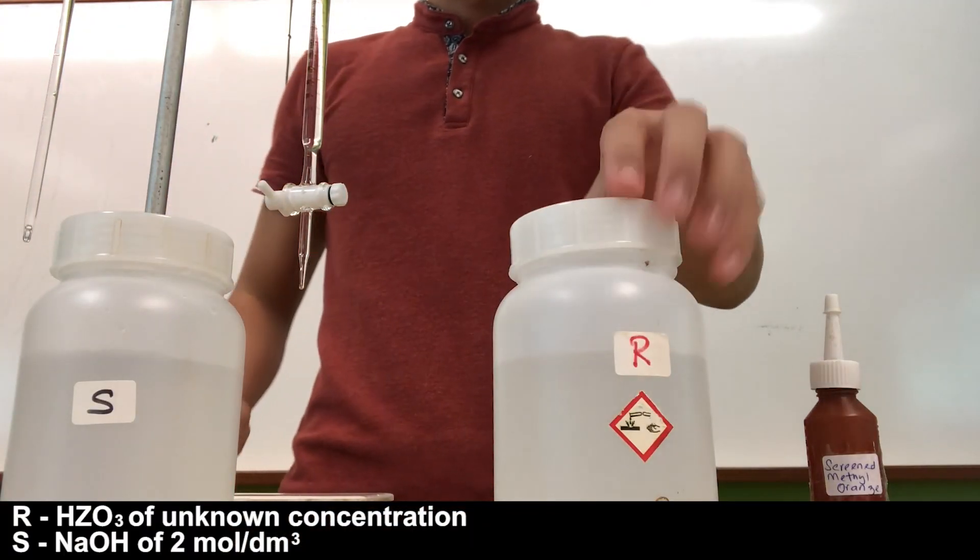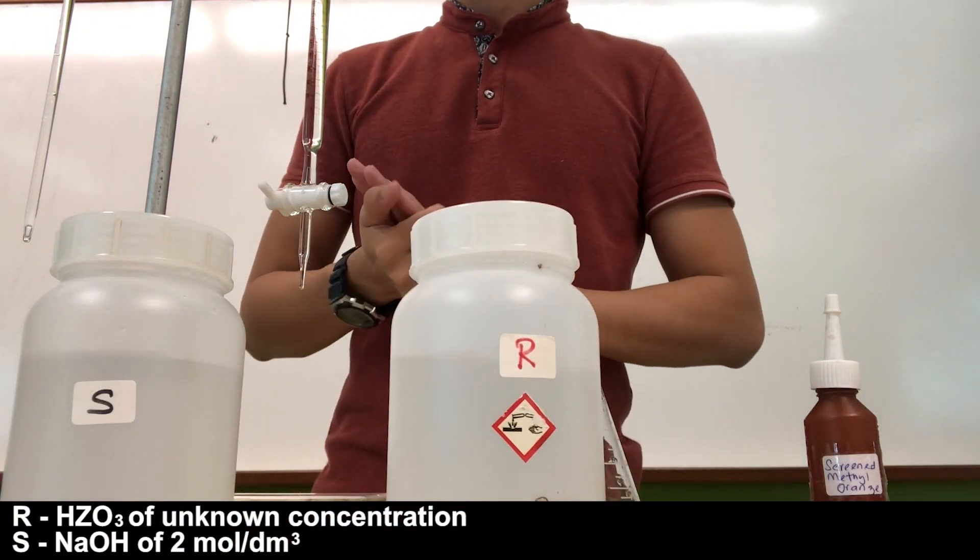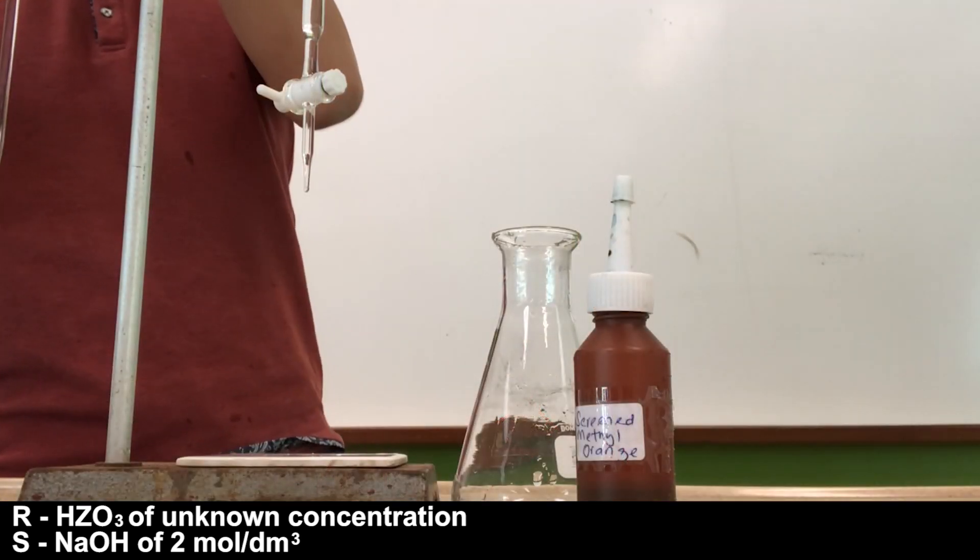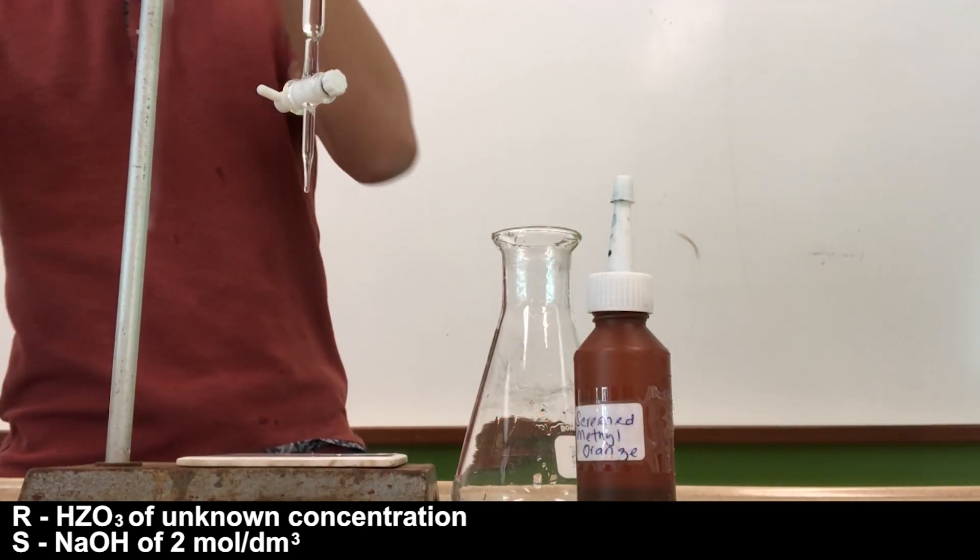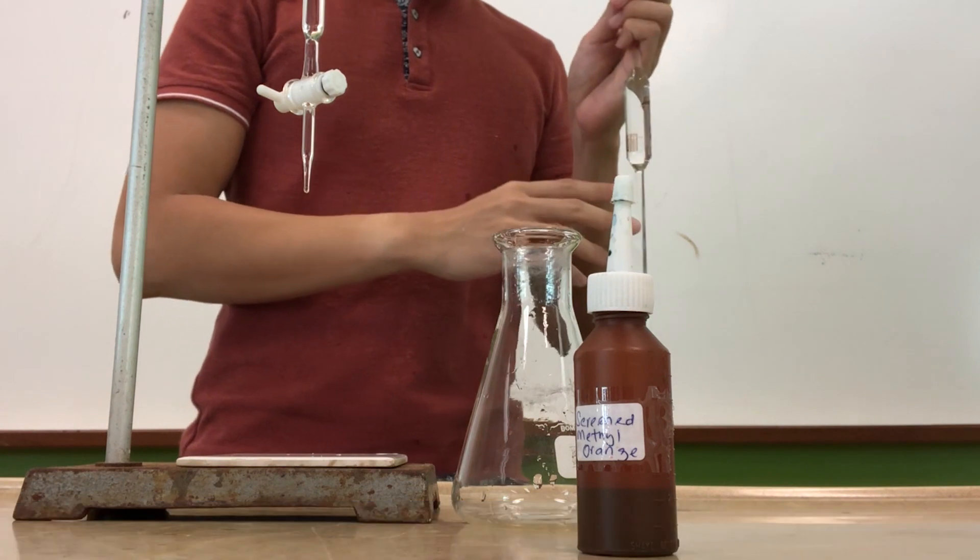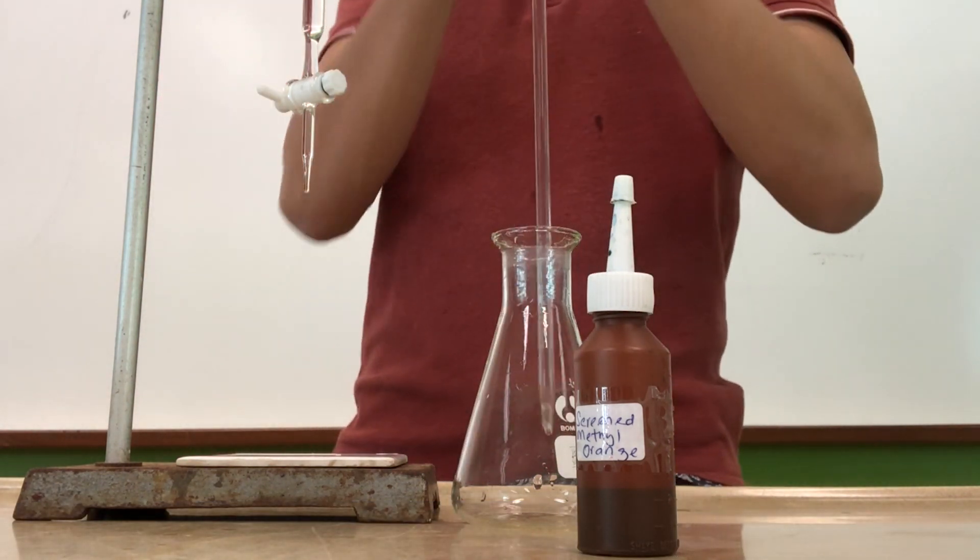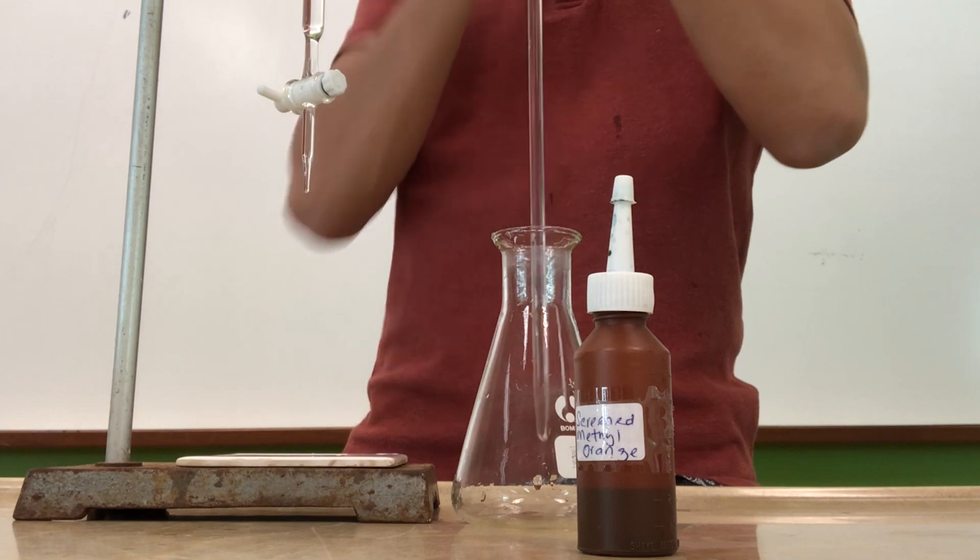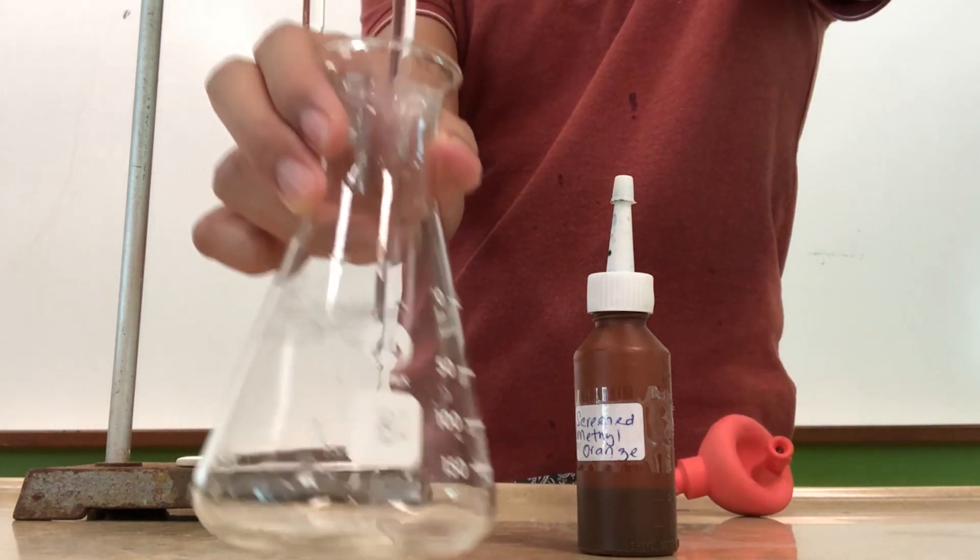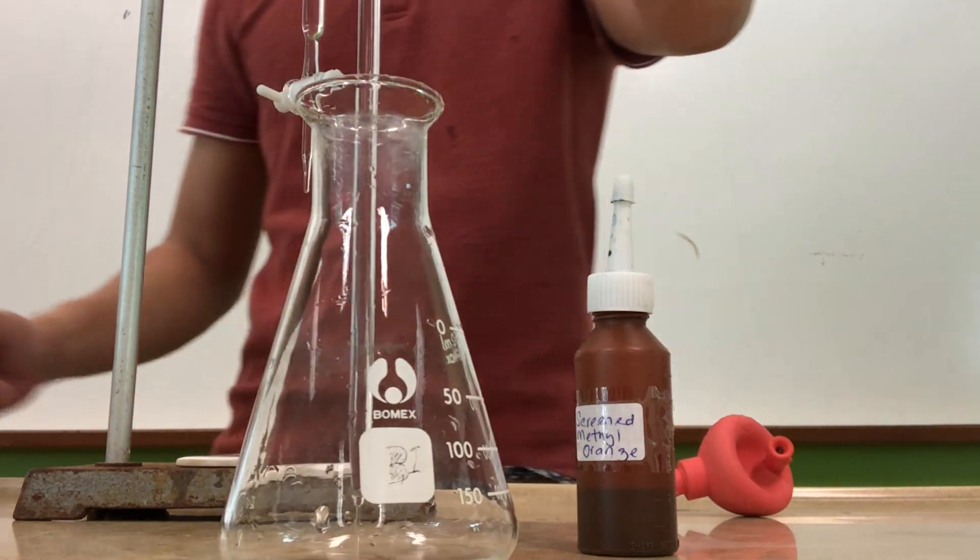In this part of the video, we are still going to do titration, but this time around we are going to use a different indicator. The solutions are exactly the same. So let us dispense the unknown acid into the conical flask. As I mentioned previously, make sure that your conical flask has already been rinsed with distilled water so that there are no impurities within it.